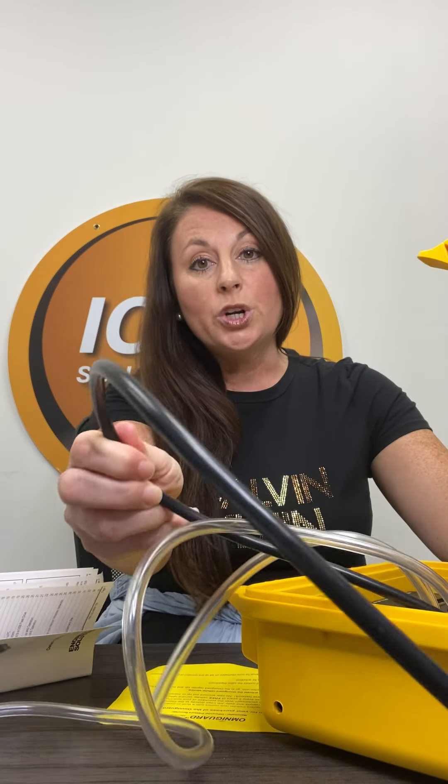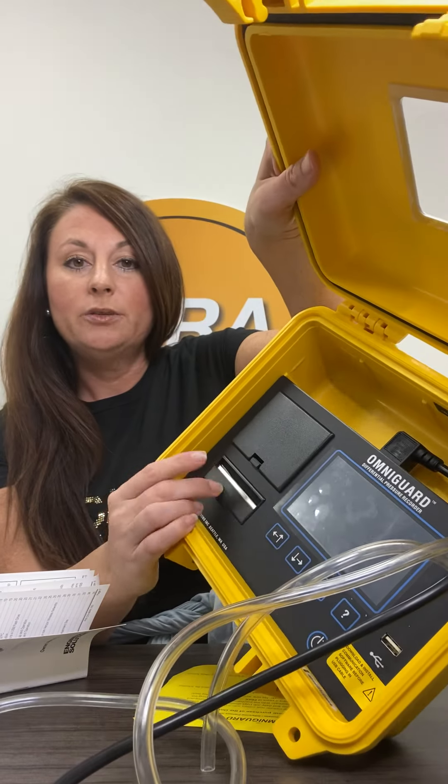When you open the pressure monitor, you'll receive some tubing and also a cord. I'm going to tell you this up front: if you are running a project, I would highly recommend do not count on the battery life. The battery life is about four to six hours on its own, so I would highly recommend that you plug this in when you are using it. Also, the printer — if you're a safety officer or someone's coming around to do rounds — it will not work unless this is plugged in. So if you want the printer to work, make sure this is plugged in.